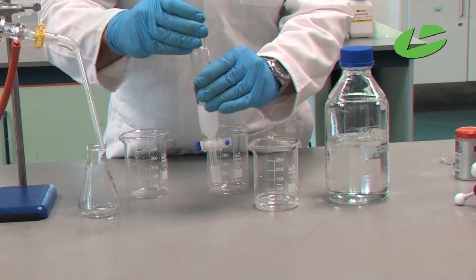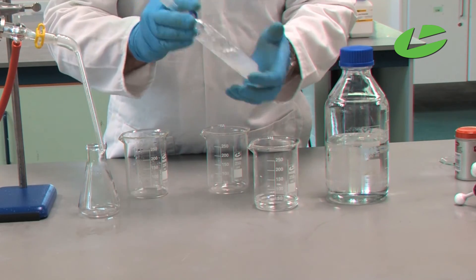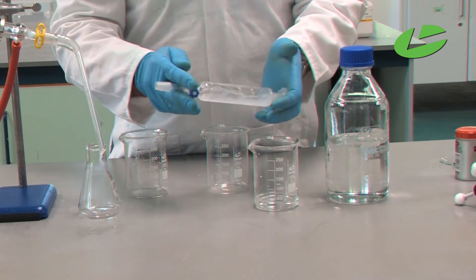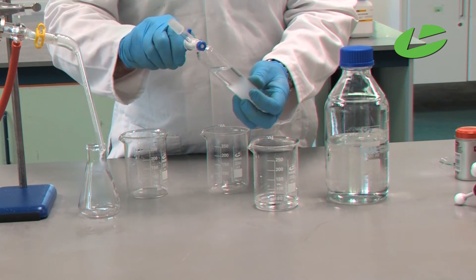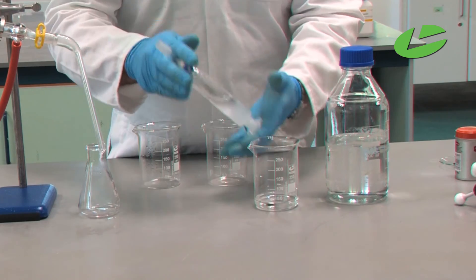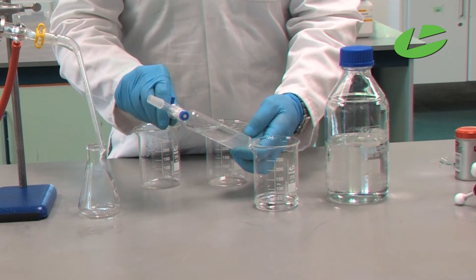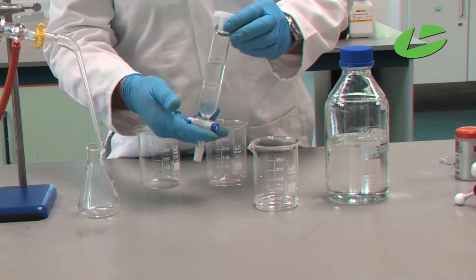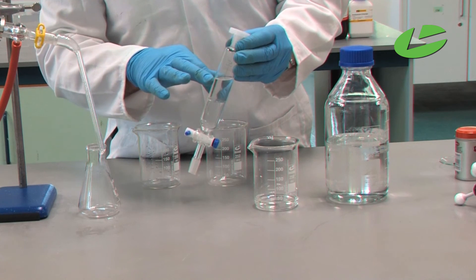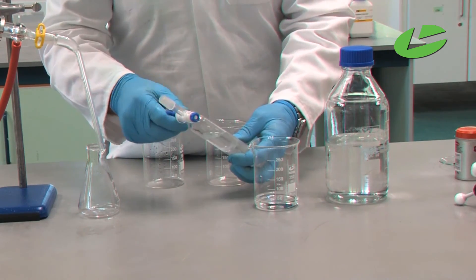Stopper the funnel tightly, then shake the separating funnel, making sure the cyclohexane and the water solution mix well — this is extracting the clove oil. If there is any pressure build-up, open the tap periodically to let it escape. You should notice the milkiness is disappearing from the water layer — that's because the clove oil is going from the water into the cyclohexane. Make sure everything has been extracted.